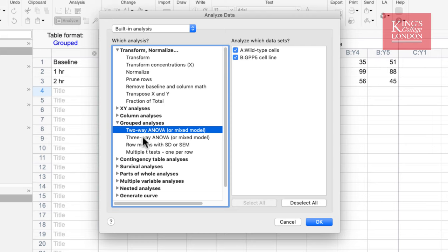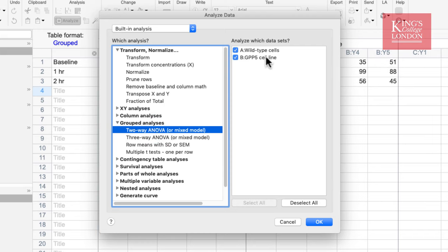We have a choice between two-way and three-way ANOVA, or we can look at row means or do multiple t-tests. Since we want to undertake a two-way ANOVA, which is the suitable test for these data, we choose two-way ANOVA and select our two data sets from the 'Analyze which data sets' box on the right-hand side. If you had more experiment groups you did not wish to include in your analyses, you can discount them here. We then press OK.